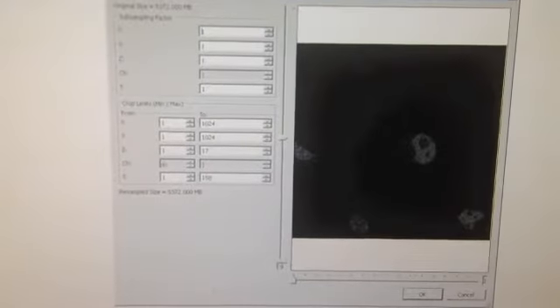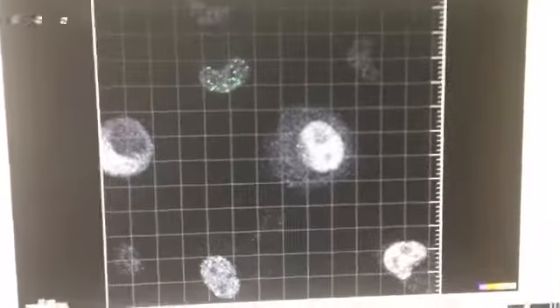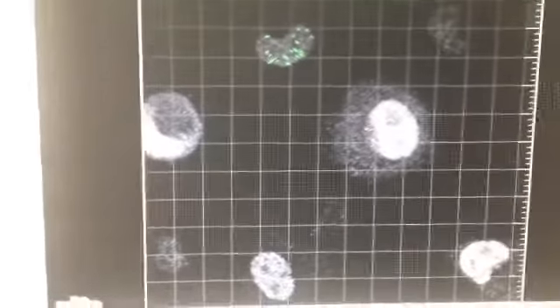Browse to where your file is. In this case, it's on the desktop. You can hit resample at this stage if you want, and you can check to see what your sample looks like. You can alter the things. Everything's okay for this one, so we'll just hit OK. You can see here that it's opened up. In this case, I've already done some analysis on this over at the right here, but we'll go through running through this again.